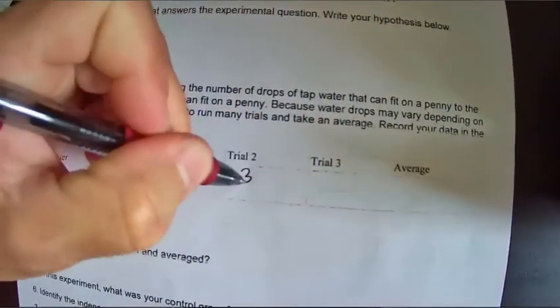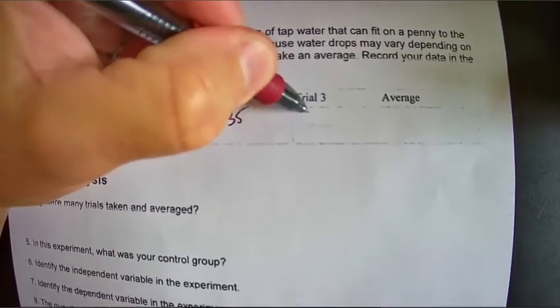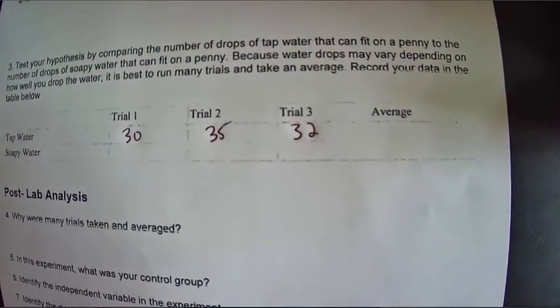So we can bring our lab paper back. Right here we got that as 35. So I'm going to set it up and do 1 more trial of that. Okay, I did 1 more trial doing the same thing and saved you the trouble of watching it. It turned out to hold 32 drops of water. So now what we're going to do is 3 trials of soapy water.